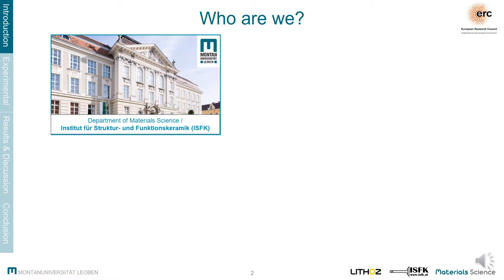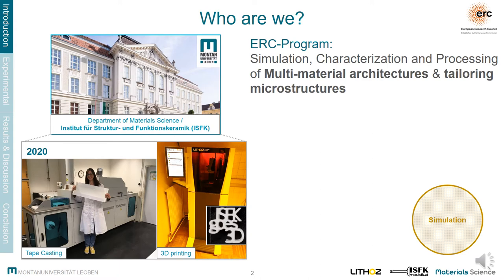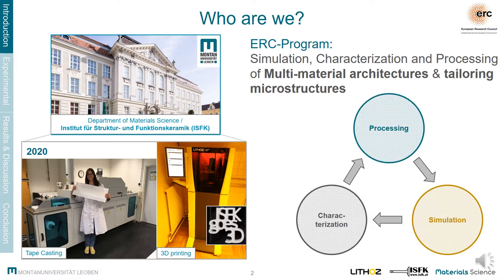I'm working at the Department of Material Science at Montanuniversität Leoben, and since last year we also have a ceramic processing lab with a tape caster and an LCM 3D printer. I'm part of the ERC program, where we have three PhD students focusing on the simulation, the characterization, and the processing of multi-material architectures, as well as the tailoring of ceramic microstructures, and I'm responsible for the processing part.